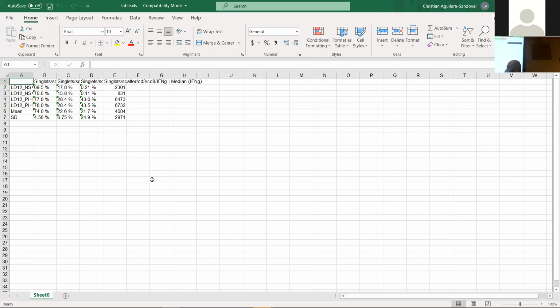Yeah. Howie is talking about a plugin that we have that's a lot of stats for us. Some stats, does correlation plots. It also does some heat maps and it does some bar graphs, well, violin plots. But we'll get to those later today. I always forget. Yeah, the afternoon is the advanced session, not tomorrow.